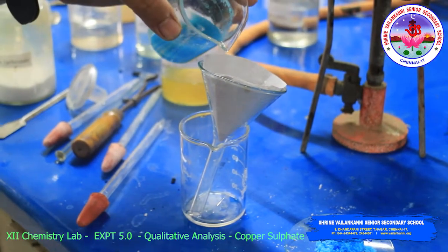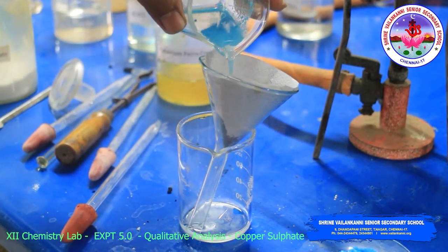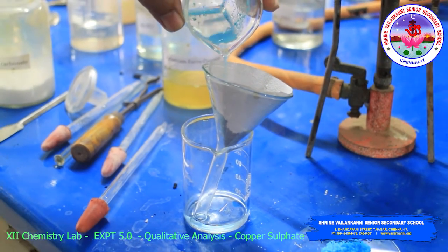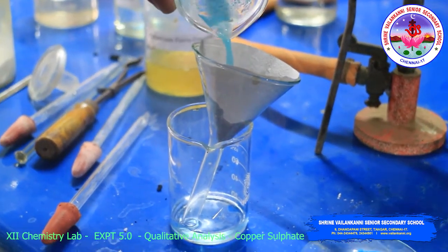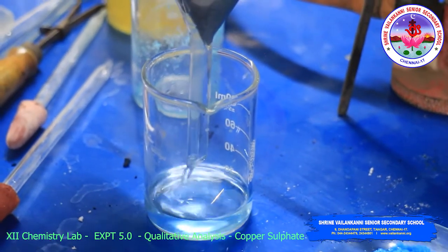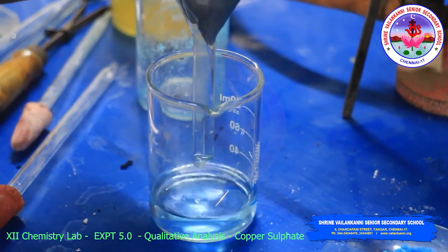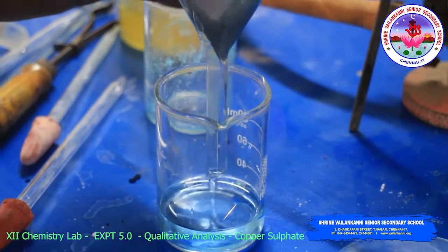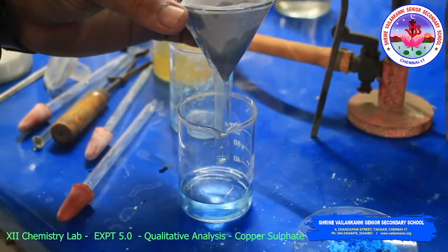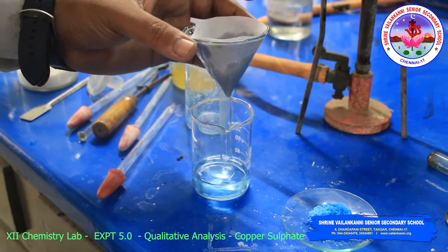After cooling, just filter the solution with the help of filter paper and funnel, slowly filtering. So this is the sodium carbonate extract solution.